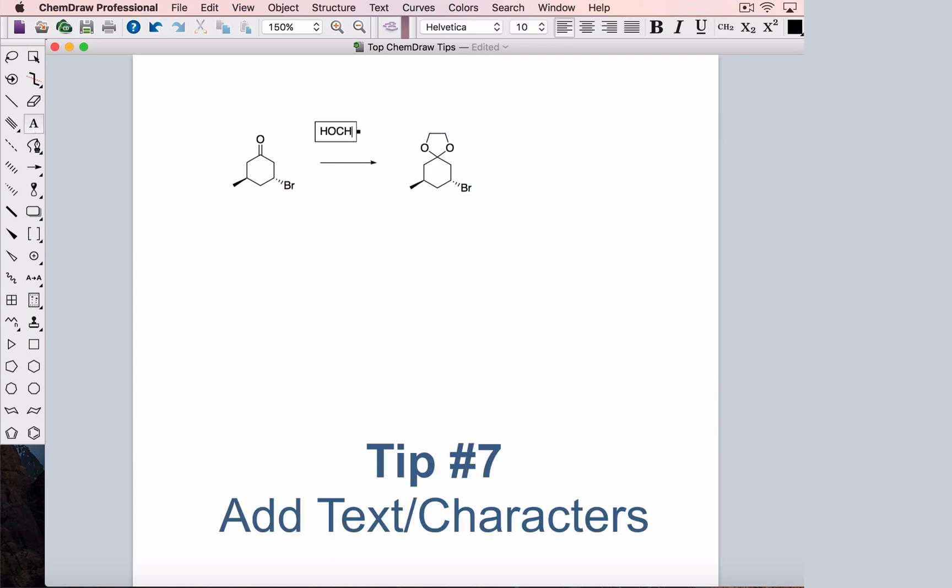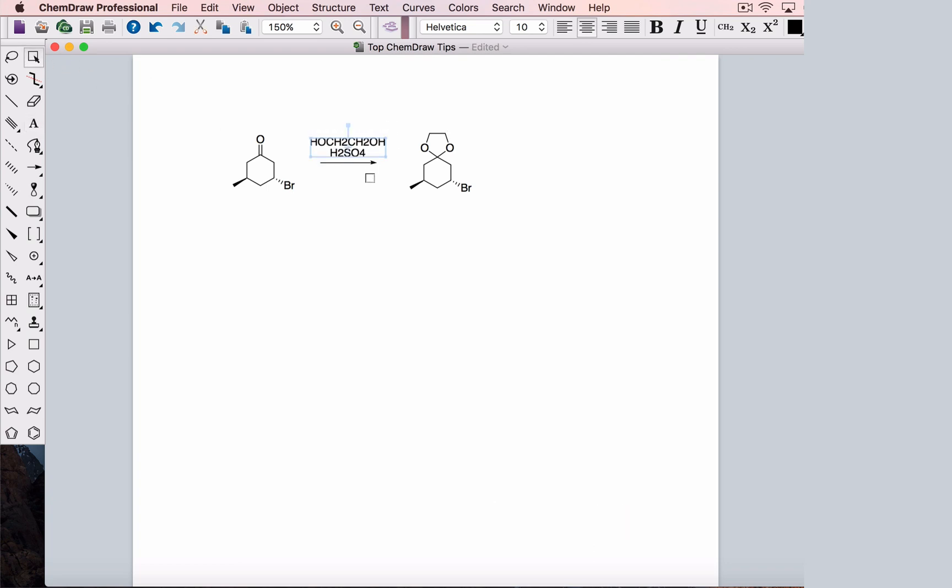There's some tricks for adding text as well. When we label something on a structure, ChemDraw automatically makes it into a formula. However, when we're typing text, ChemDraw doesn't know if we want it to be a formula or not. We need to tell the program this is a formula by selecting the text and clicking this little CH2 here, which makes the selected text into a formula.